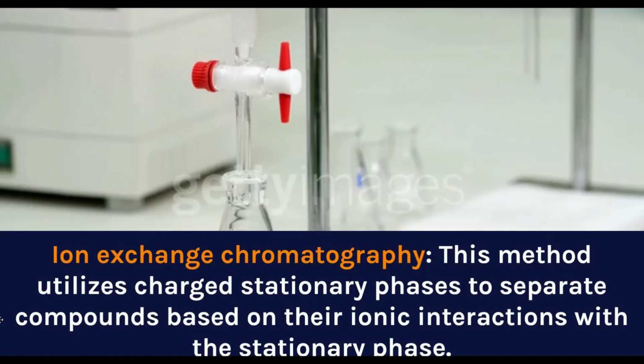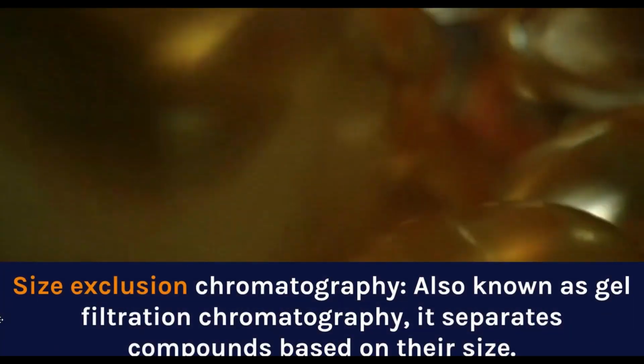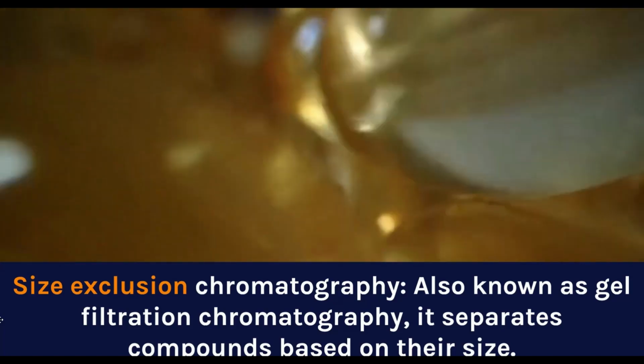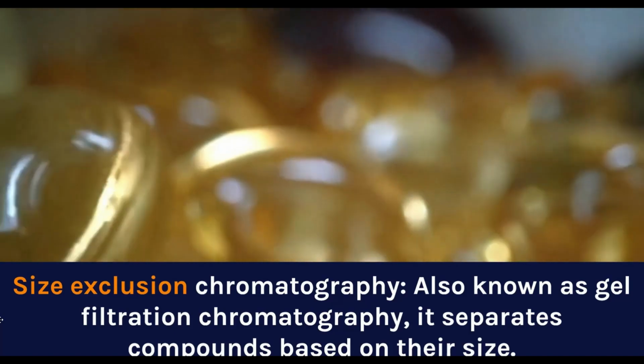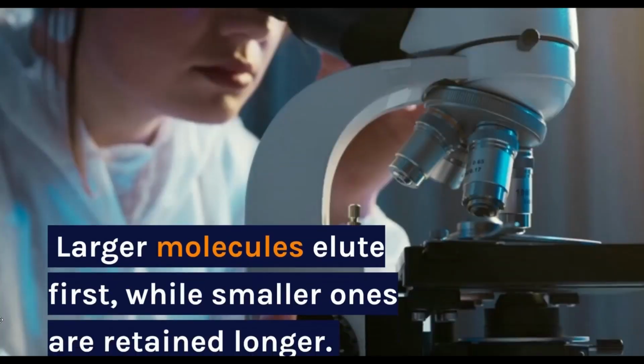Ion exchange chromatography. This method utilizes charged stationary phases to separate compounds based on their ionic interactions with the stationary phase. Size exclusion chromatography, also known as gel filtration chromatography, separates compounds based on their size. Larger molecules elute first, while smaller ones are retained longer.